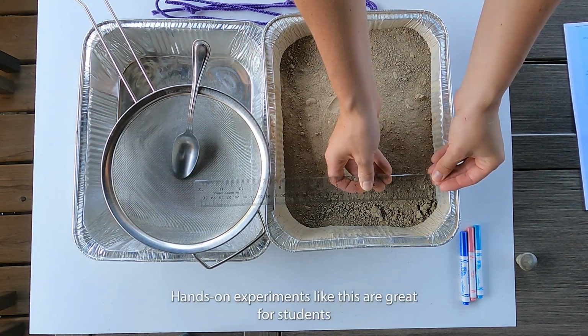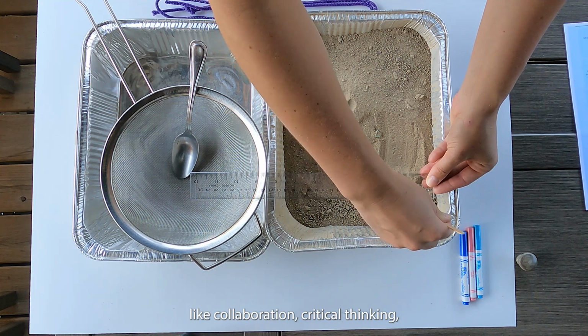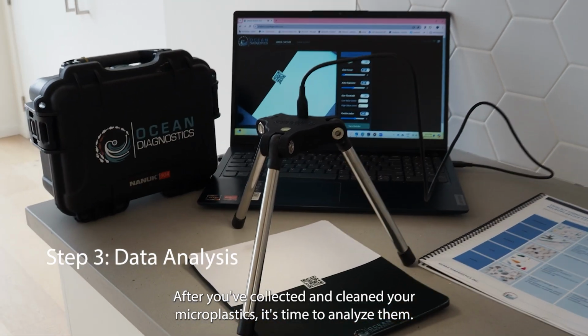Hands-on experiments like this are great for students to learn about the scientific method and the skills needed for sampling, like collaboration, critical thinking, and environmental awareness, while making it fun and engaging for them. After you've collected and cleaned your microplastics, it's time to analyze them.